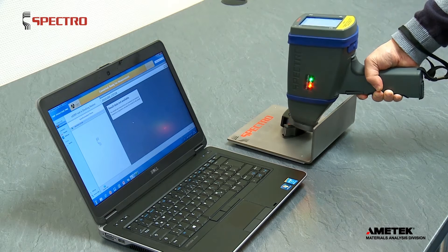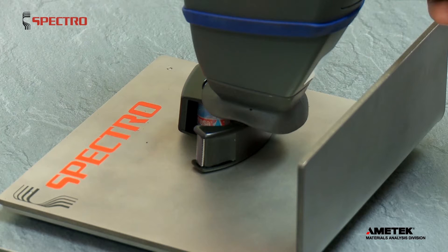To analyze small or non-metallic samples, lay the sample on the radiation protection shield.